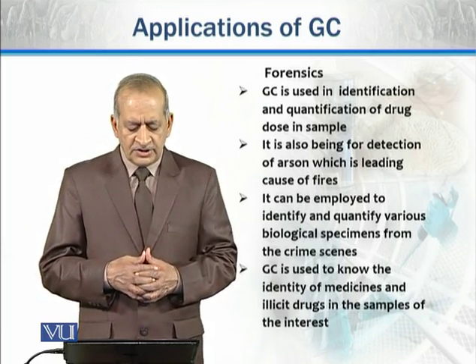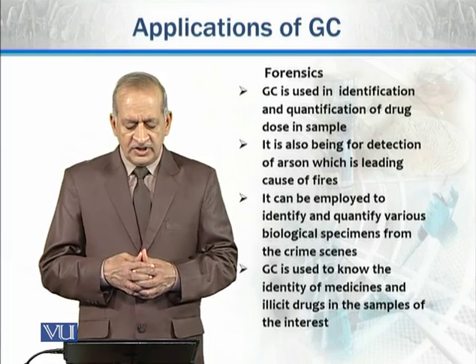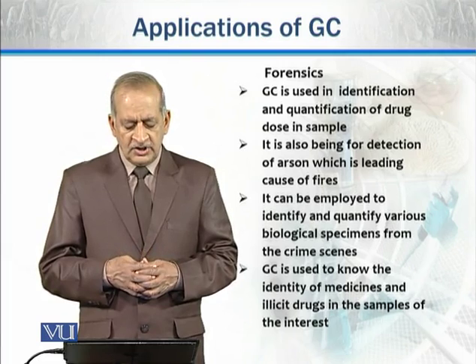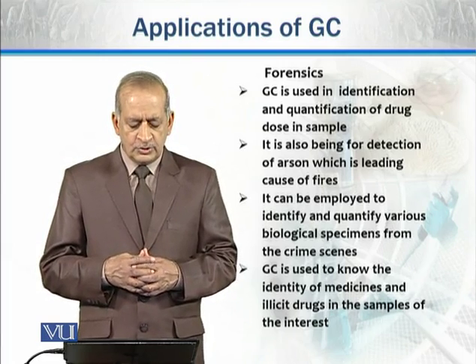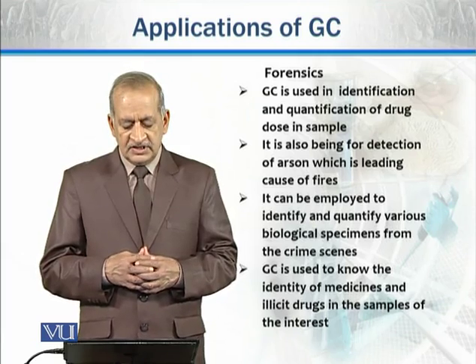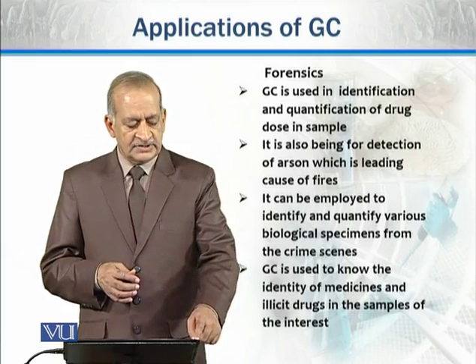It can be employed to identify various biological specimens from the crime scene also, and GC is also used to know the identity of medicines and illicit drugs present in the samples of interest.